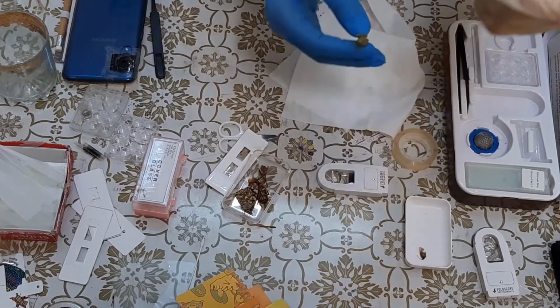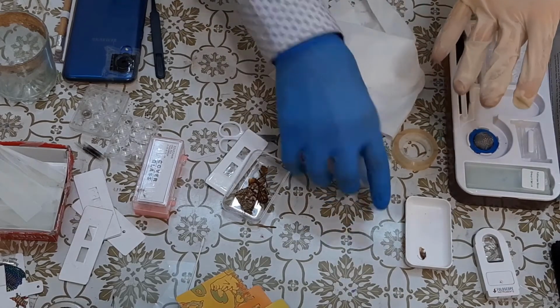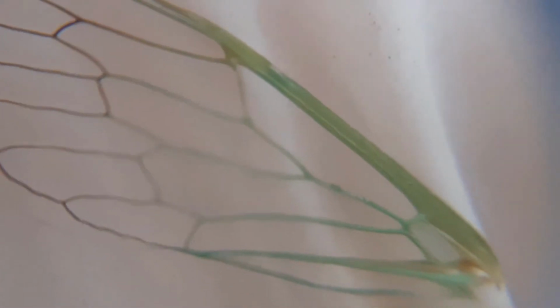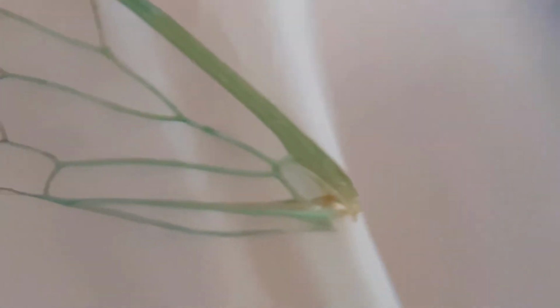So now we have this, the wing. I'm going to show you the wing here directly in the video using the Foldscope magnifier. So these things are not too small to need a microscopic lens, but you can also see it with the magnifier kit.